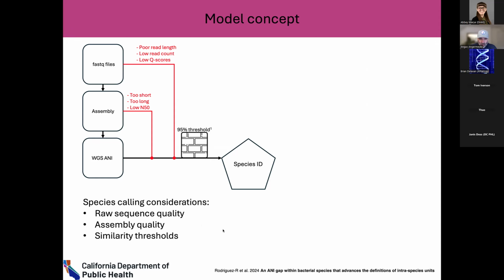So at the moment, I'm using 95%. That's obviously tunable, and I'll talk a little bit more later about the validation. But that's kind of what I'm starting with for the threshold on this.